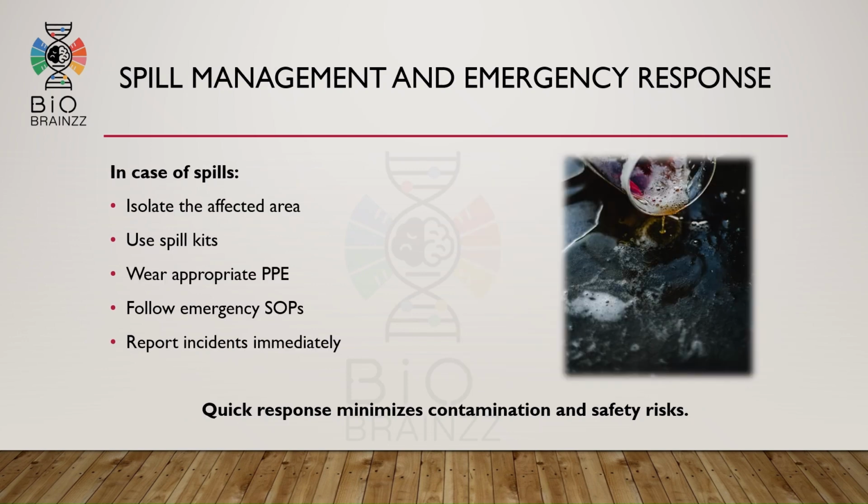In case of spills, the affected area should be isolated immediately. Spill kits should be used according to emergency SOPs. Appropriate PPE must be worn during cleanup procedures. All incidents should be reported immediately. Quick response helps minimize contamination and safety risk.